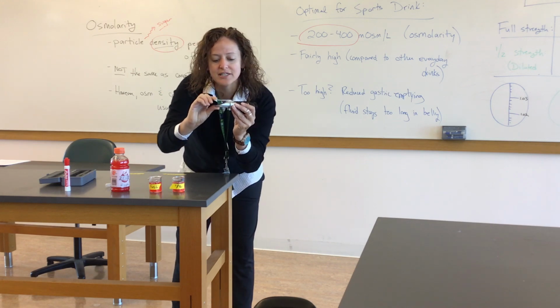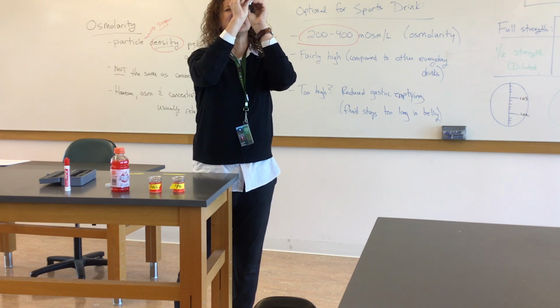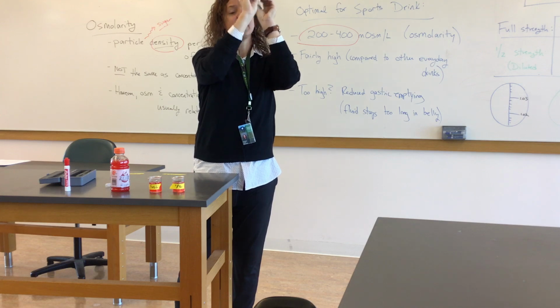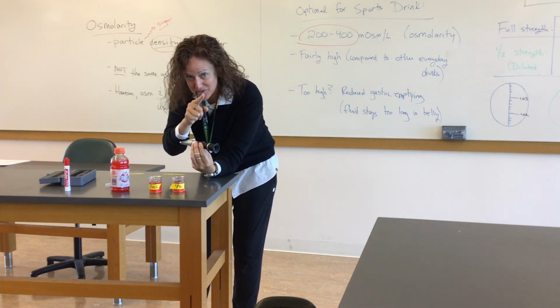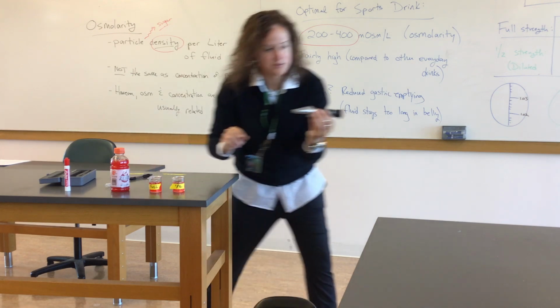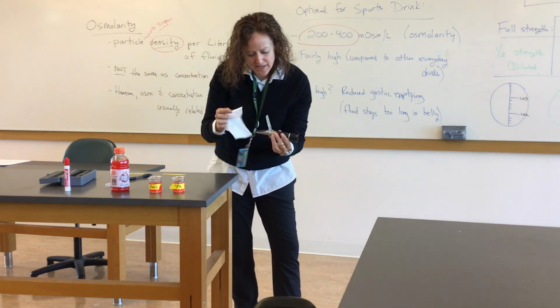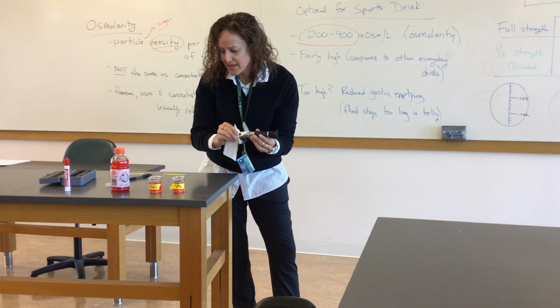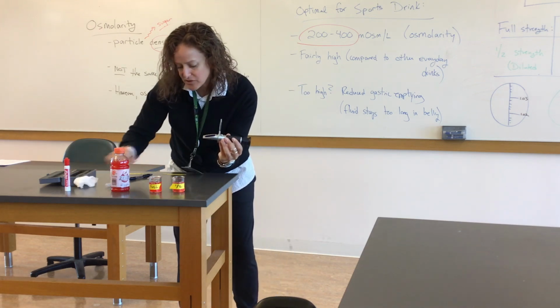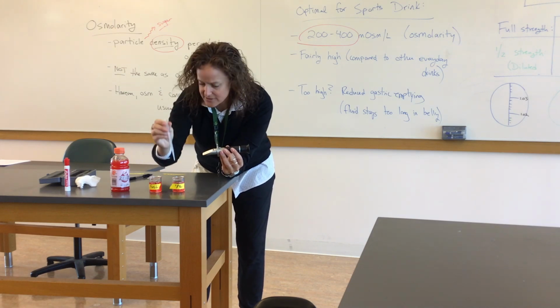So I'm going to close this and slowly look into the light, and I'm going to read a number. I have the number. I'm recording it here because I've got to change the screen to show you what it looks like. So we're going to do a full strength. Do you ever dilute your Gatorade? If I ever need Gatorade, I prefer to dilute it because it's just a personal preference. It's a little too sweet for me. So it's pretty common practice to dilute it.